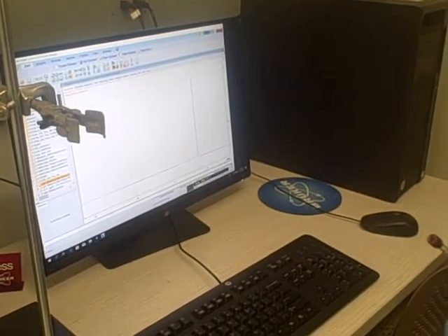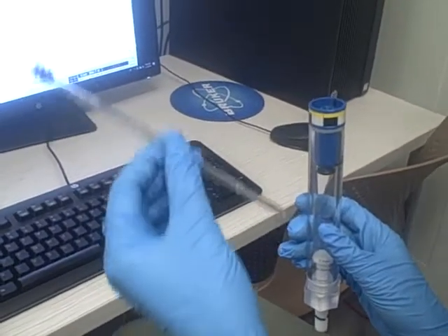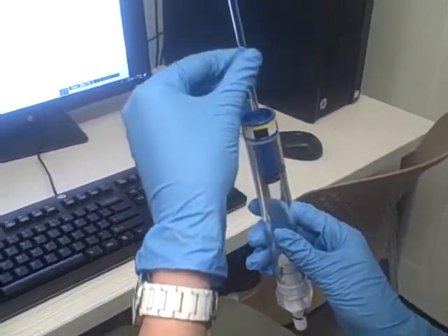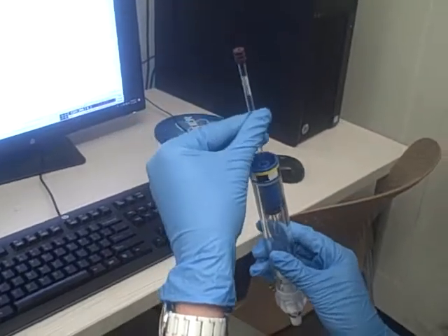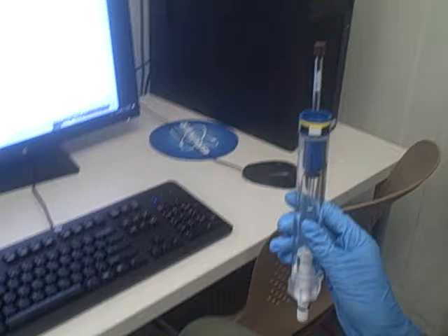So today we're going to learn how to use the NMR. So the first thing Elaine is going to show you is how to set our sample within the NMR spinner. Be careful not to press from the top because you don't want to put one of these NMR tubes through your hand. That would be incredibly painful.